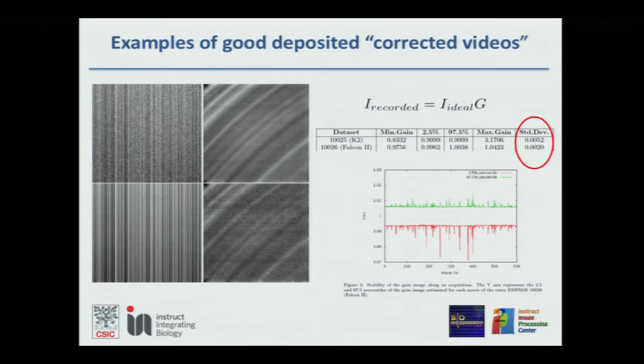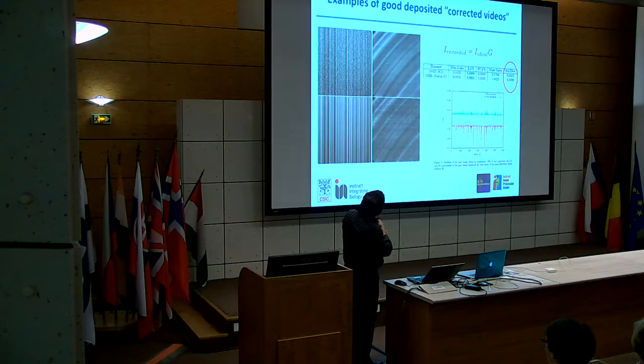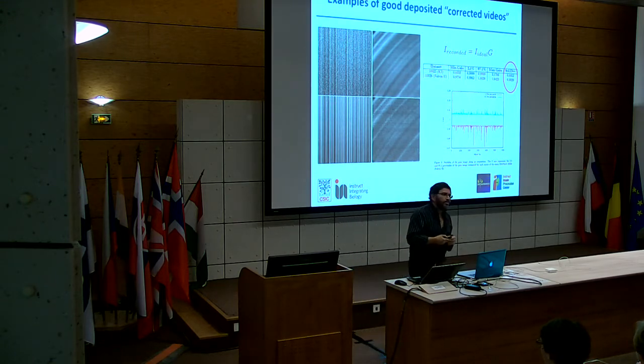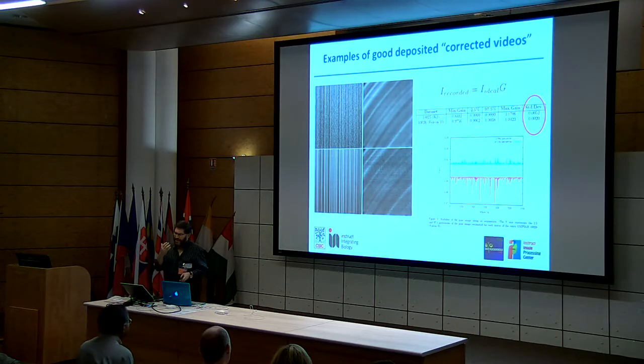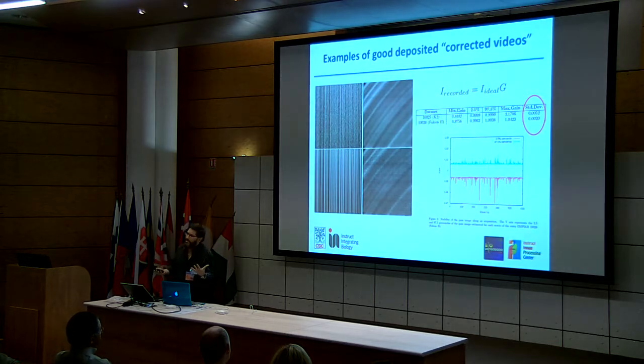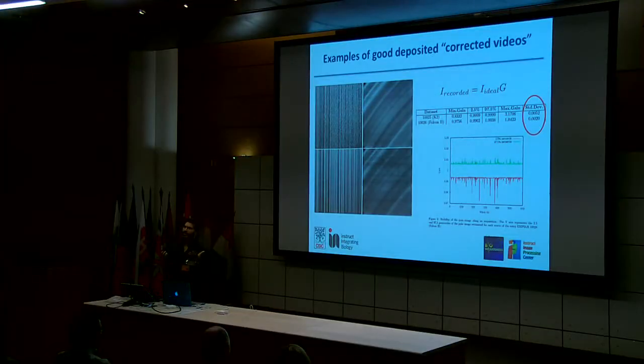And really, we have checked that this works very well. These are deposited gain images, and these are computed or estimated gain images. They work very well. They are able to provide a good estimation of what your gain images are, and we have used them not so much to estimate your gain image, but to put it in the normal procedure in the lab, in which you have already estimated your gain. You have corrected your gain.